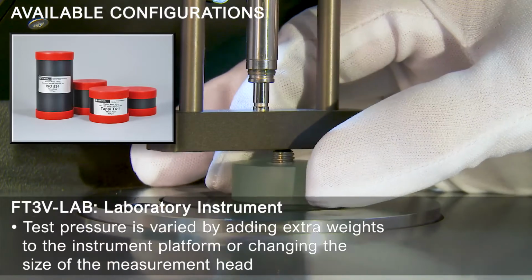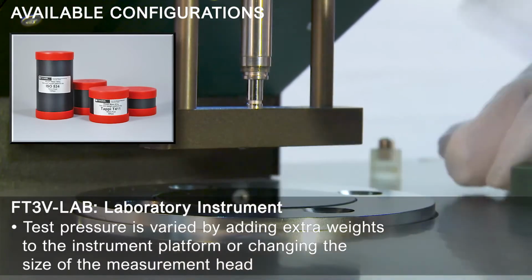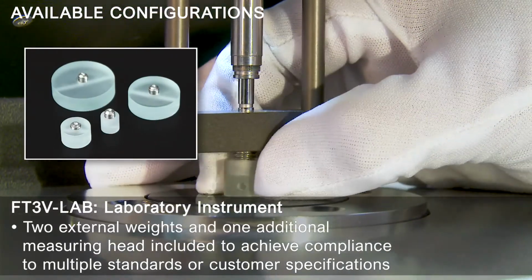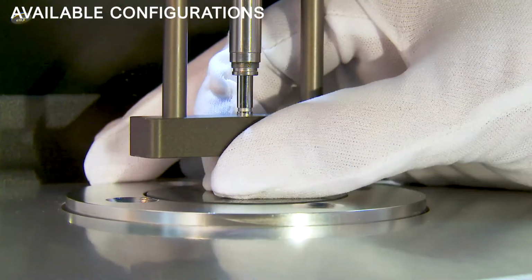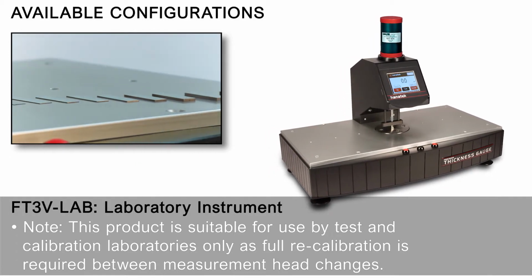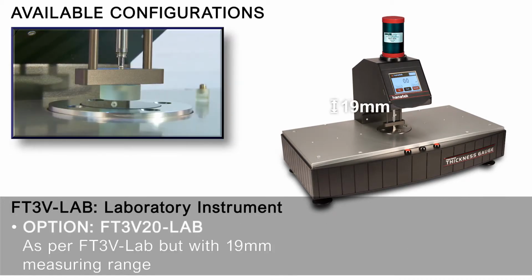FT3V Lab, laboratory instrument. Test pressure is varied by adding extra weights to the instrument platform or changing the size of the measurement head. 2 external weights and 1 additional measuring head included to achieve compliance to multiple standards or customer specifications. Note: this product is suitable for use by test and calibration laboratories only, as full recalibration is required between measurement head changes. Option: FT3 V20 Lab, as per FT3V Lab, but with 19mm measuring range.